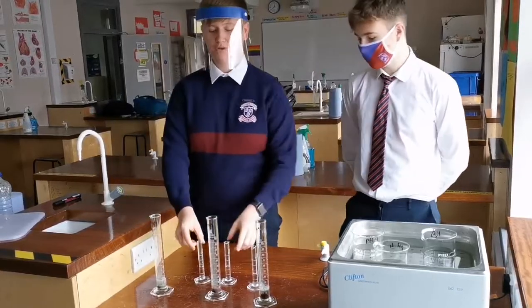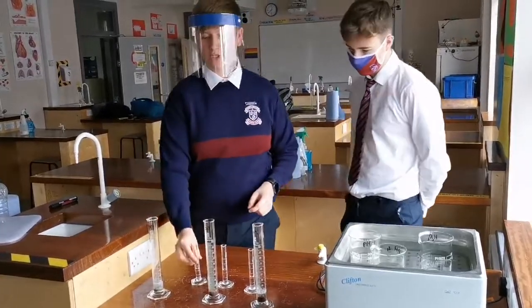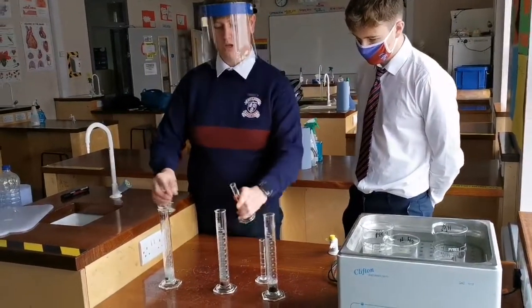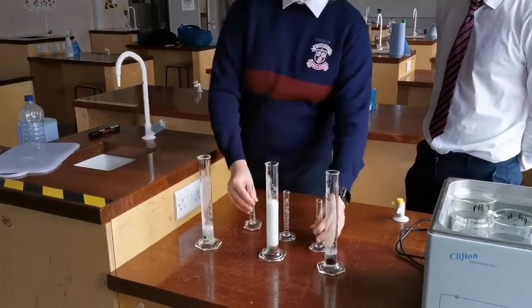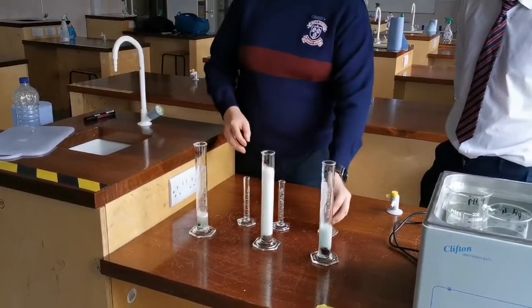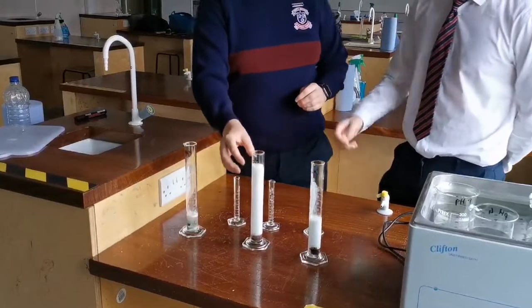We have some hydrogen peroxide here that I'm going to pour into each one of the test tubes — hydrogen peroxide into test tubes 1, 2, and number 3.